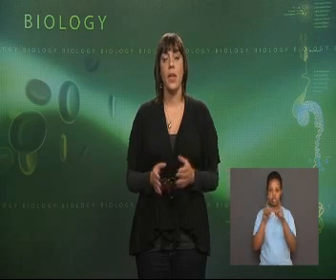Hello, teacher. Hello, students. Welcome to today's lesson on testing for lipids. In our last lesson, we learned about testing for proteins. We studied the Biuret test, which indicates peptide links using a Biuret reagent. We also briefly studied the structure and functions of proteins and the formation of amino acids.